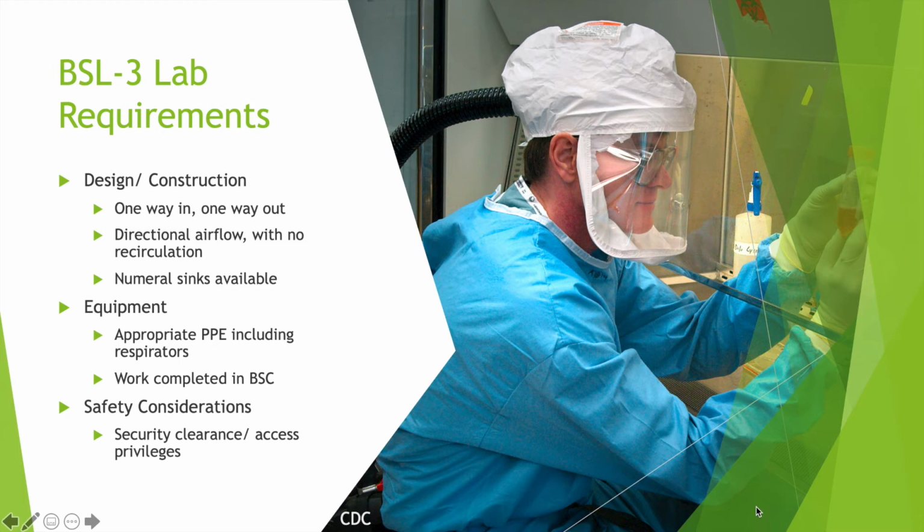Only personnel who are well versed, educated, and trained in biosafety with the microbes within the lab in which they're working should have access. Most air supply to the lab cannot be recirculated and must pass through a HEPA filter. Additionally, air pulled into the lab should come from clean surrounding areas and move toward more potentially contaminated areas within the lab. Appropriate PPE must always be worn.